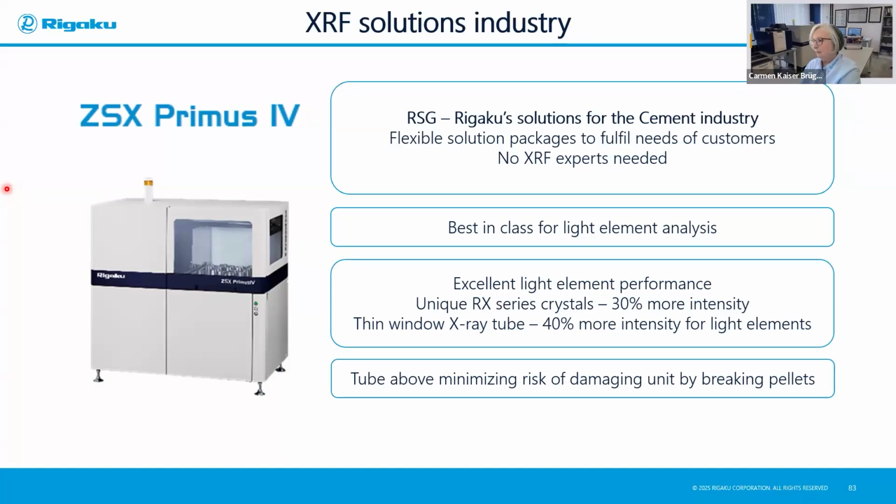But if it's a metal sample or a very heavy matrix like this, the important part is it's solid already, but we need to ensure that our analytical surface is highly polished and very flat and smooth, because the signal of boron will be measured only from the very surface. So it's a surface analysis, in fact from the top 20 micron layer. So it's always important to choose the correct preparation method, considering the type of material or sample that we would like to measure.